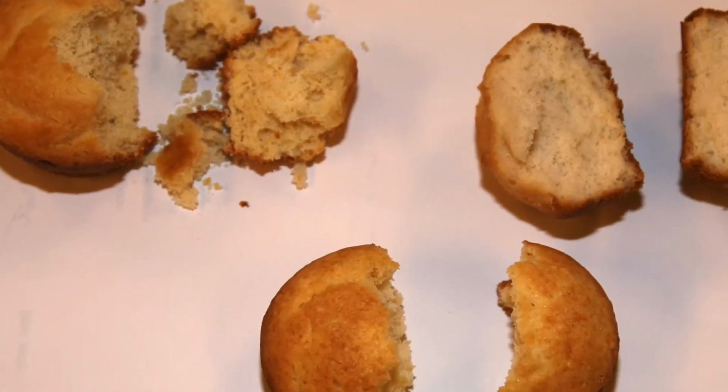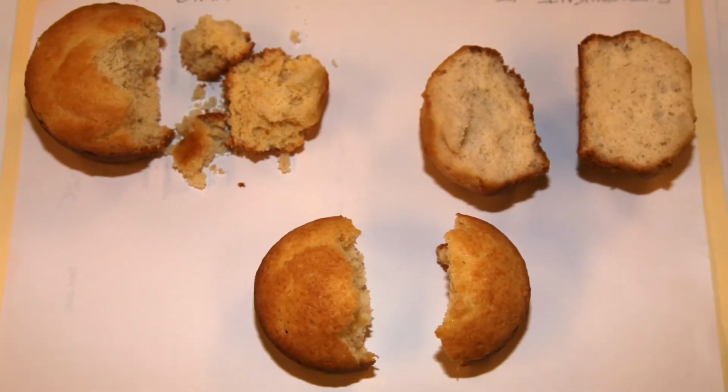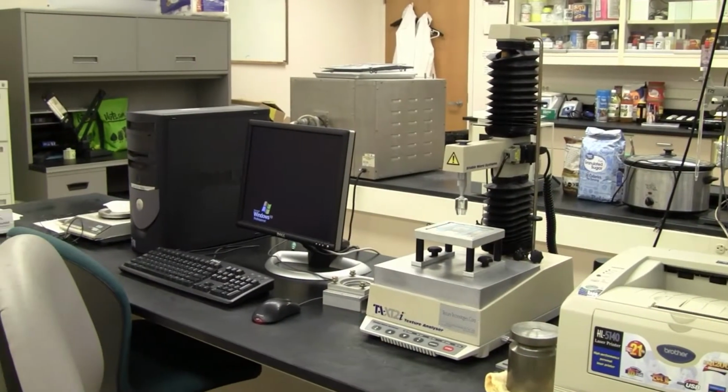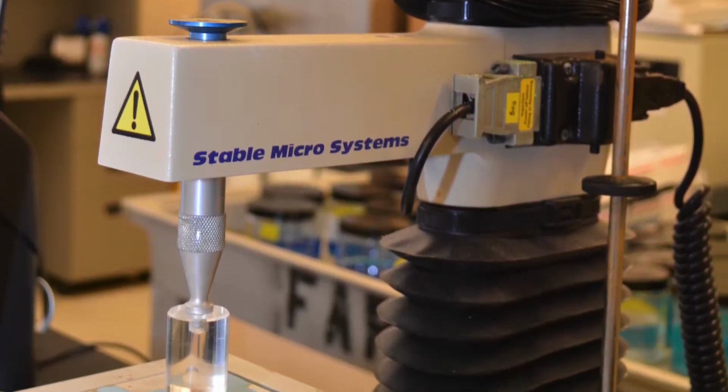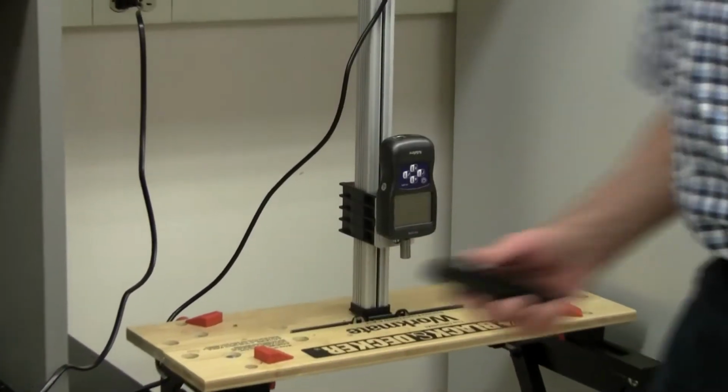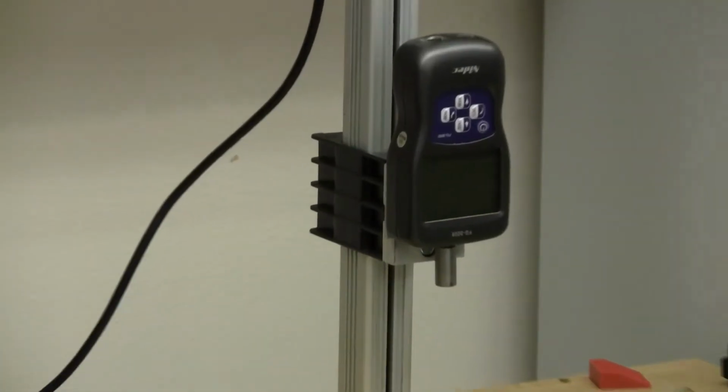A lot of the companies I work with could really benefit by understanding and being able to measure the texture of their food products. Texture can be related to shelf life and food quality especially. The equipment that is typically used for that process is very expensive. And because of new advances in electronics and robotics, we're able to actually build a texture testing machine very inexpensively.